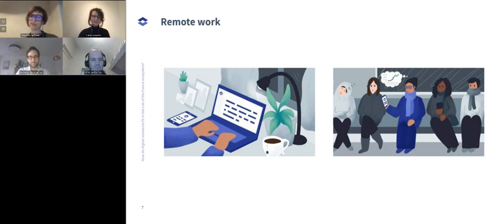Very good point, Andrew. And I think additionally, especially in this new normal, we're witnessing a more distributed way of working. So we have some groups, and the handover of work becomes much more frequent. And to add to your point, if someone else comes in to pick up that Post-it and make sense of the last step that was done, it's not so easy. So this is, I think, also where a more digital way of documenting wins.